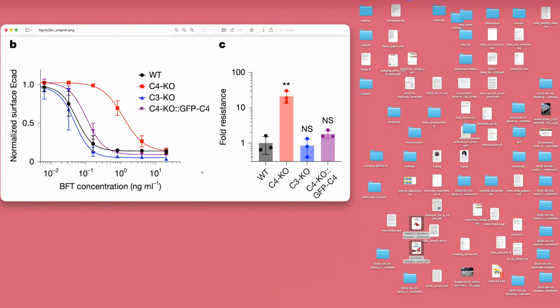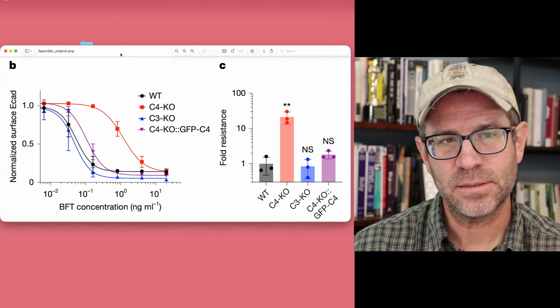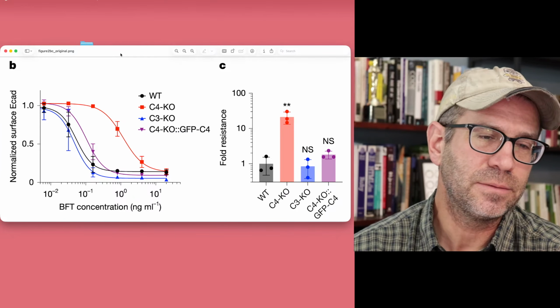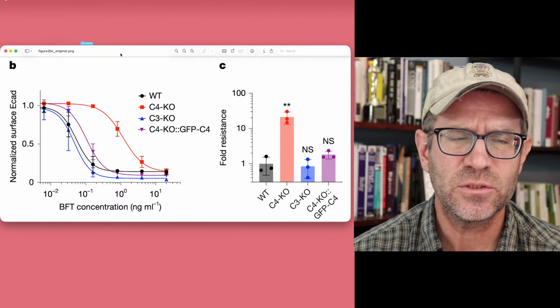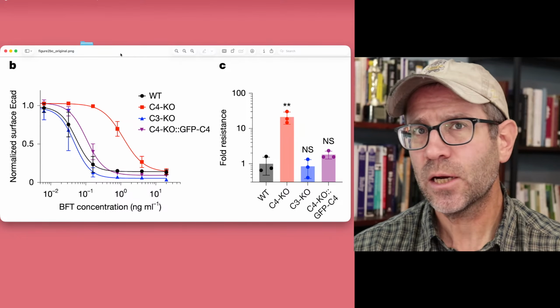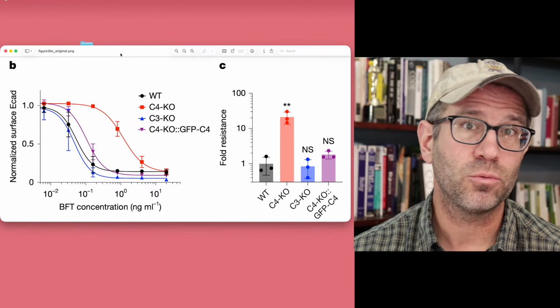And so my goal for today is to work with you to recreate this set of panels that was recently published in a paper in the journal Nature. The lab that this came out of was from Cynthia Sears at Johns Hopkins University, and there were other collaborators, but she was the senior author on that paper. And what they're interested in is the role of gut microbes in driving colorectal cancer.